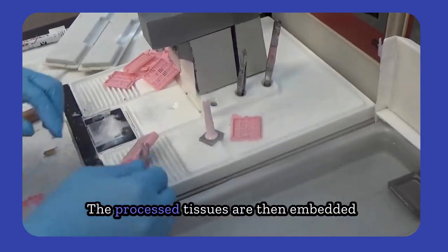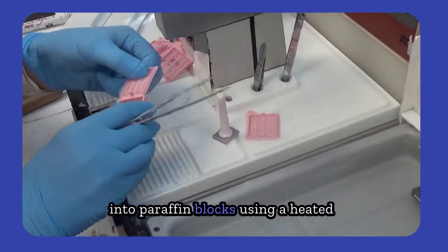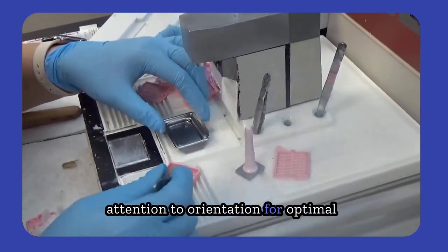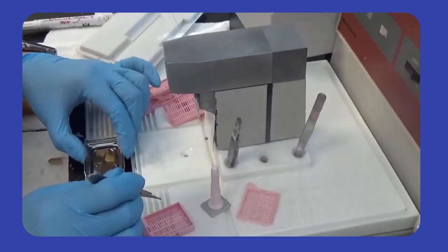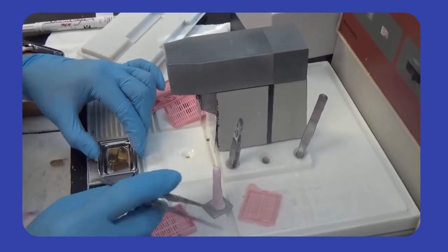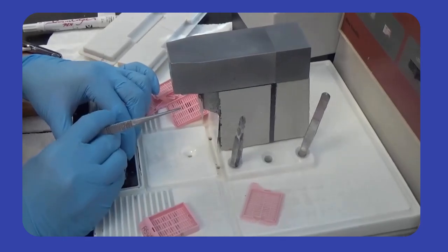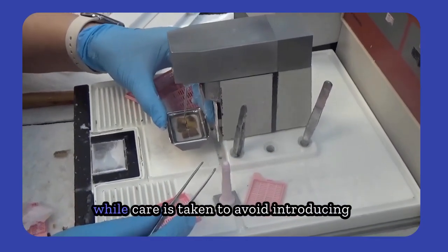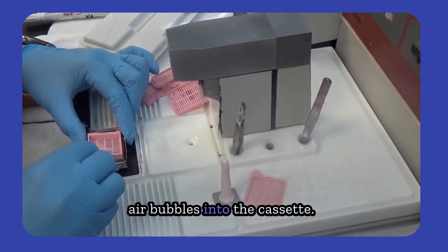The next day, the processed tissues are then embedded into paraffin blocks using a heated embedding station, with careful attention to orientation for optimal sectioning of different tissue types. Melted paraffin is steadily added to the mold to fully surround the tissue, while care is taken to avoid introducing air bubbles into the cassette.